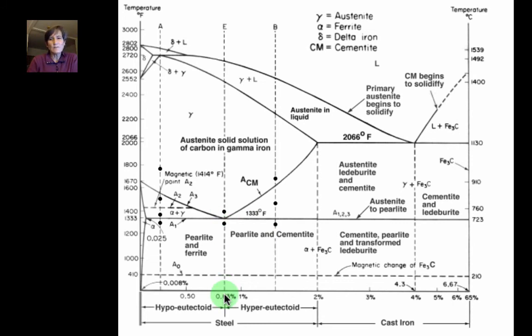Now, in the end, you still have the same amount of carbon and iron together, and by XRF, you can't differentiate the two different structures, because the difference in these structures is caused by the different phases' crystal structure, not by different chemistry.